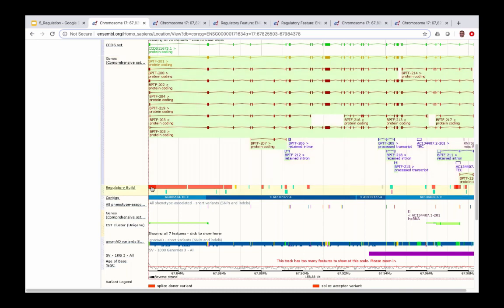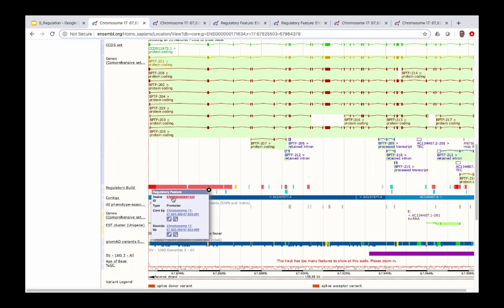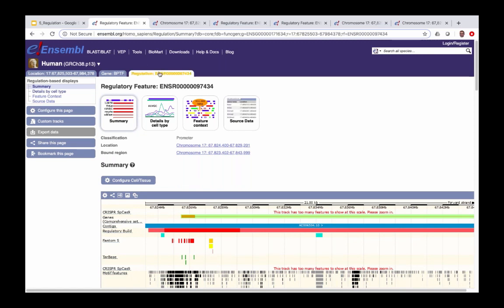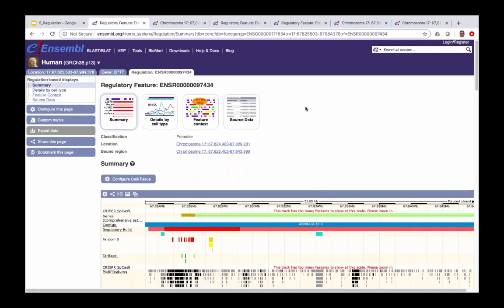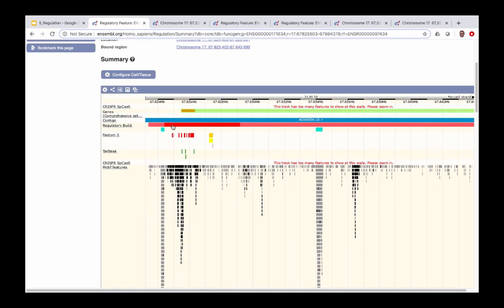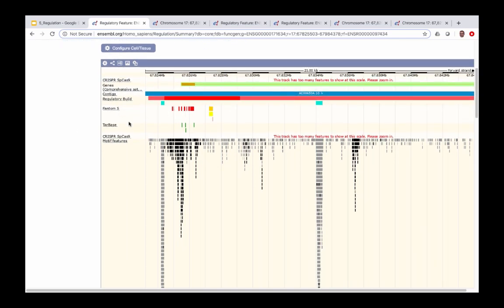Clicking on the promoter of interest opens a pop-up window with information about the feature: a stable ID, the feature type (promoter), and the coordinates. Clicking on the stable ID brings us to the regulation tab with information all about this regulatory feature. Scrolling down we can see the regulatory build track showing our promoter, data from the FANTOM5 project, data from Tarbase including miRNA targets, and further down, motif features.